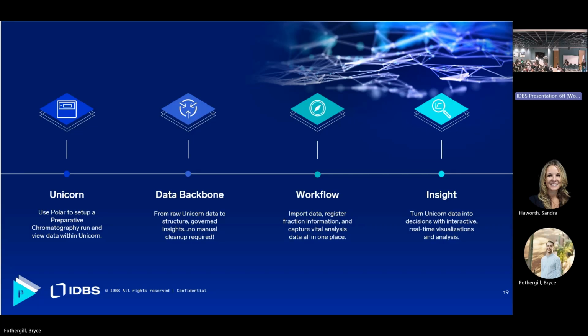This is purely an example of what we can do currently, and what we could do in the future with more integrations. We have ligand binding specific workflows that do talk to Insight apps and bring through that specific data. So it's not just chromatography. That's just what we're showing here today.